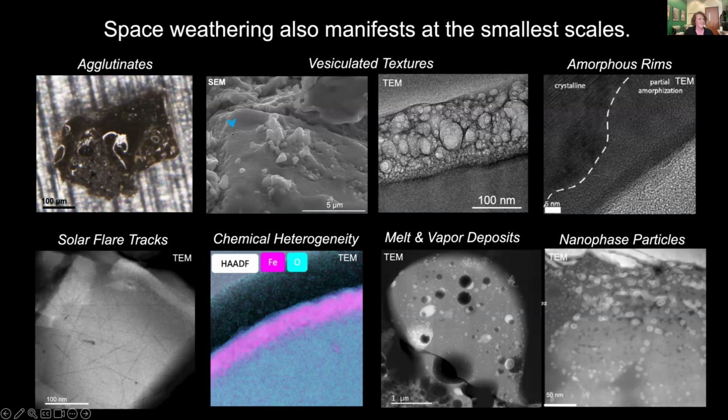The first they noticed in this SEM image is this sort of hummocky or bumpy surface texture. These are vesicles that form below the surface as a result of those hydrogen and helium ions that are being implanted from the solar wind. If we take a cross-section of that grain and look at it in the transmission electron microscope, you can see these bubbles or vesicles that develop as a result of that irradiation from the solar wind. Now note the scale bar here.